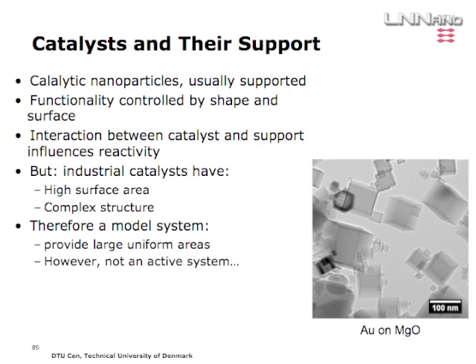One of the most interesting or unexplored territories of catalysis is the interaction between surfaces and particles, so support surfaces and particles.